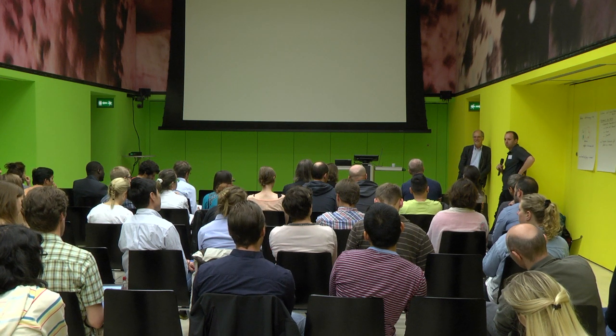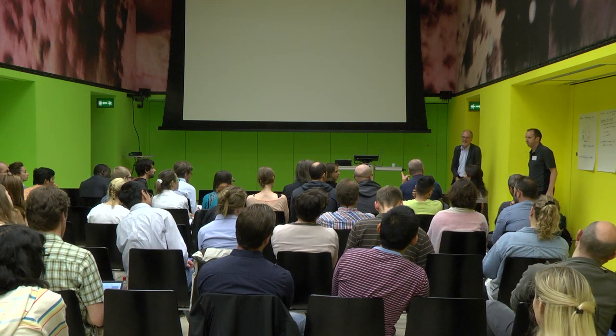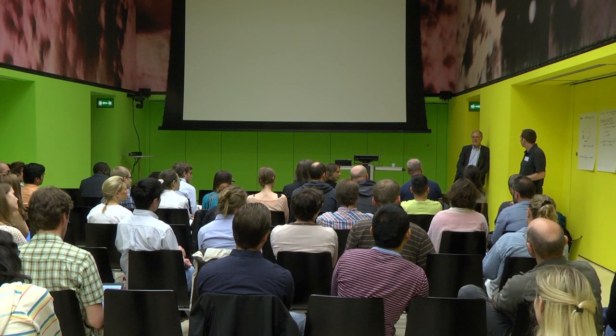Okay, thank you. But this was data from MS1. The selection window, the 10 ppm. You're recording MS1 and then you're doing MS.